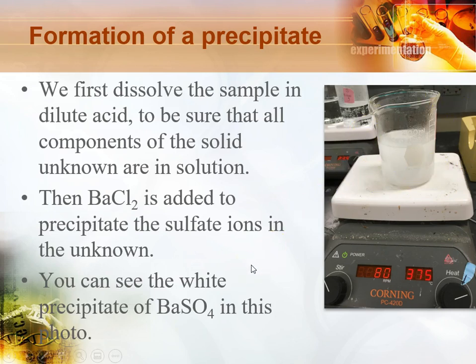You get this very cloudy looking solution right here, and the cloudiness is just dispersed particles of the solid barium sulfate. Also you can see that I'm heating this because we want to do some gentle heating to make sure that all of the components of the unknown dissolve in the solution.